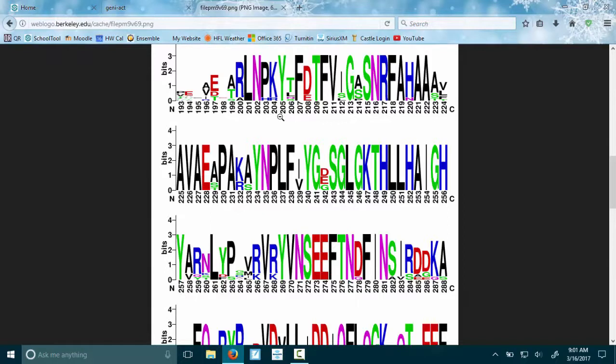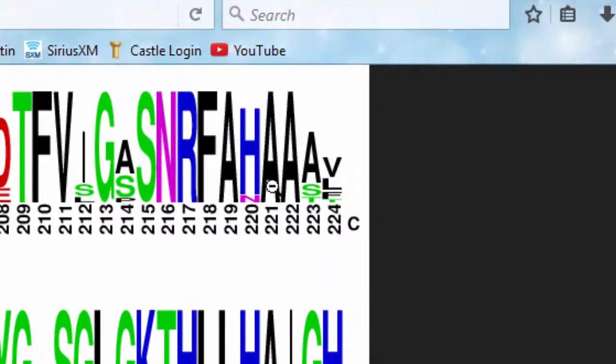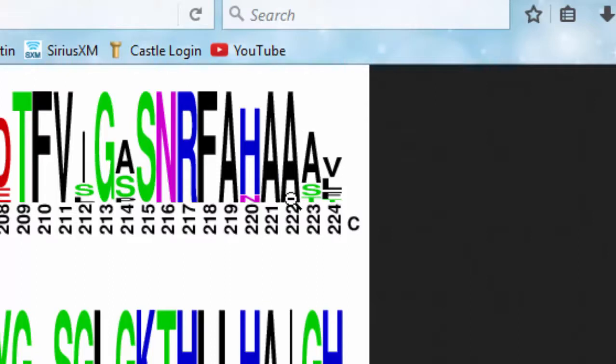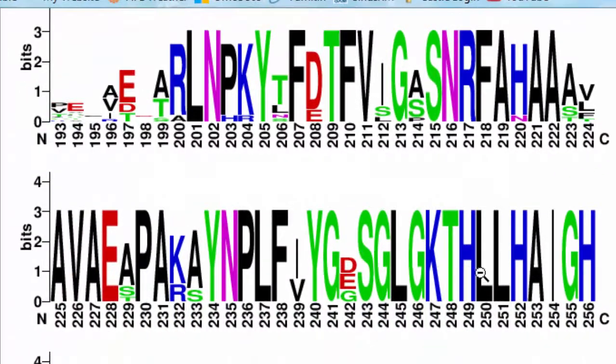The size of the letters means something. I'm on page 55 in your manual. The taller the letter means that that letter appeared in the different sequences from the different bacteria more often. So, like for example, these two letter A's right here—they showed up in those two positions; they were the only thing that showed up in those two positions.